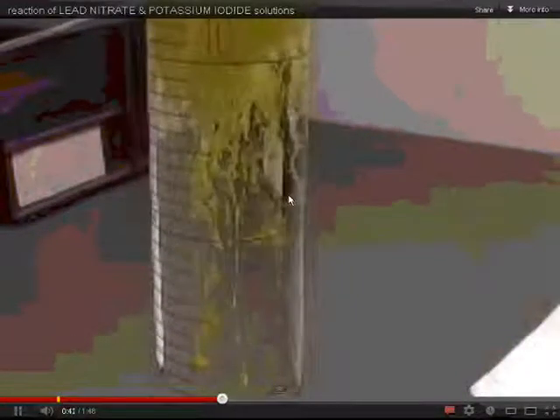Now in a second, the video is going to zoom in, and we're going to see solid particles starting to form. You're getting a bonding between the two liquids, and let's just watch for a second. They're going to pour some more in, get a nice yellow color. You can see there's starting to be all these little pieces in there, and they go to the bottom, they're more dense. These are your precipitates.